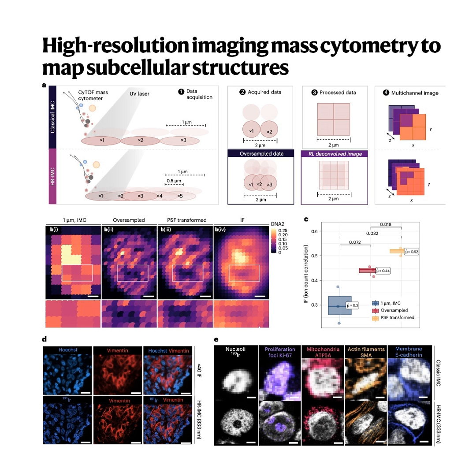Being able to spatially define these microregions is the necessary first step to understanding the signaling that happens within them. So when they tracked the drug response, treating the HGSOC cells with standard chemotherapy, carboplatin and paclitaxel, what did the high-res view confirm? It confirmed all the expected biologically consistent shifts, but with this unprecedented spatial clarity. They saw a massive upregulation of DNA damage and repair foci like PH2AX clusters, and a significant downregulation of proliferative clusters. So the therapy was clearly inducing DNA damage and shutting down cell division, which is what you'd hope to see.